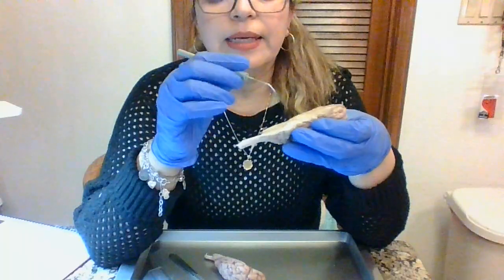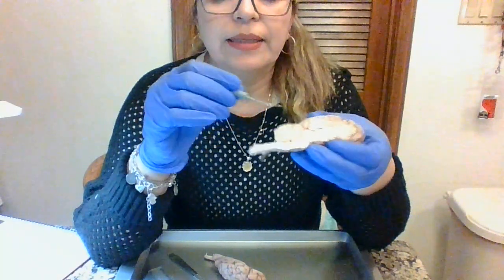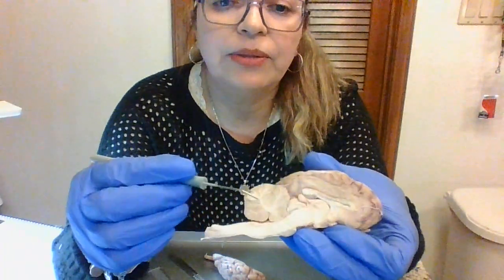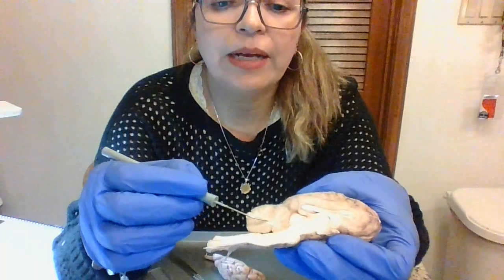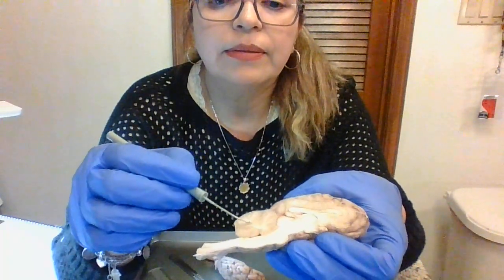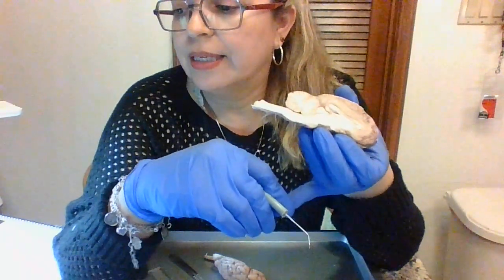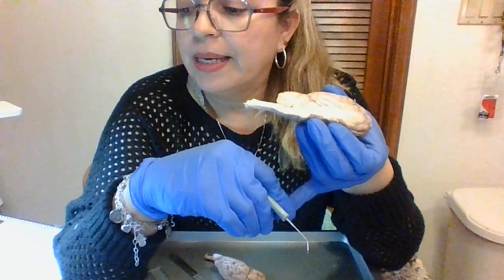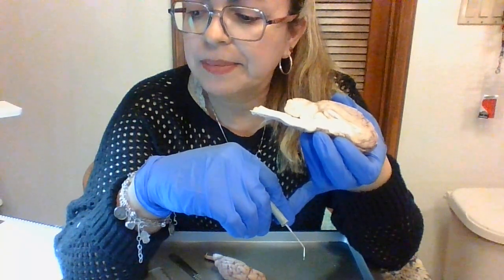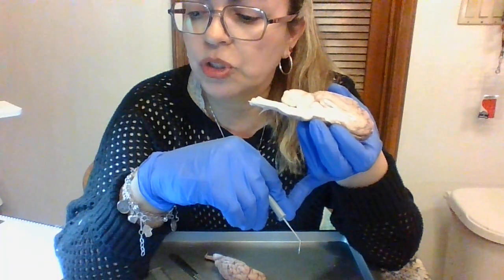The next thing is the arbor vitae. The arbor vitae tracks, as you can see, those white tracks that are right here on the cerebellum are called arbor vitae. It is made of white matter tracks and transmits sensory and motor information, coordinating body movements, balance and posture.